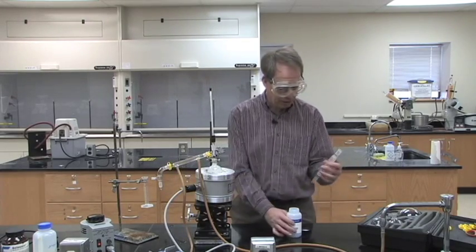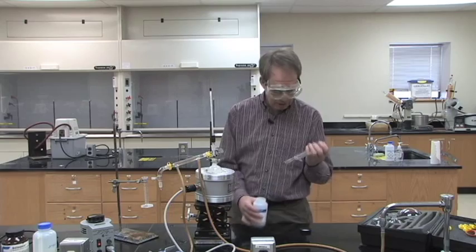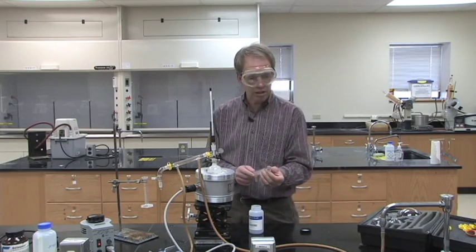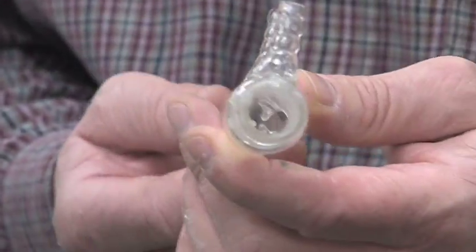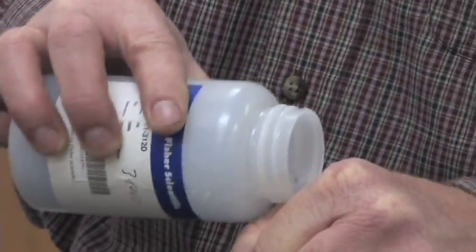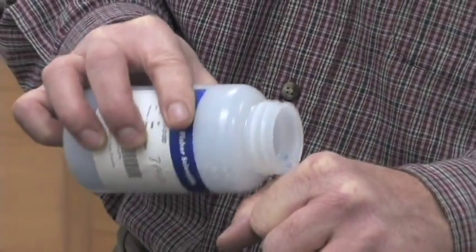The other condenser, if you look down the center of it, you'll see three little pieces of glass poked out into the center of the condenser so that you can pour something down in the condenser and it'll catch it and hold it in there.